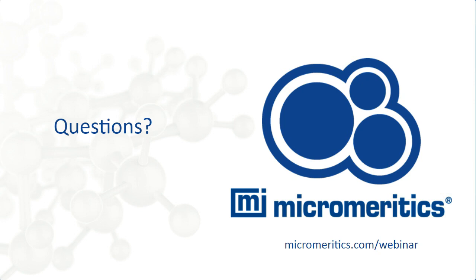The next question is a bit material specific. For microporous materials, what points should be used for BET, or should someone use Dubinin rather than BET? Yeah, so what points is something that we can't answer in general because it's not the same pressure range for all microporous materials. Here again, I would recommend using the auto BET.